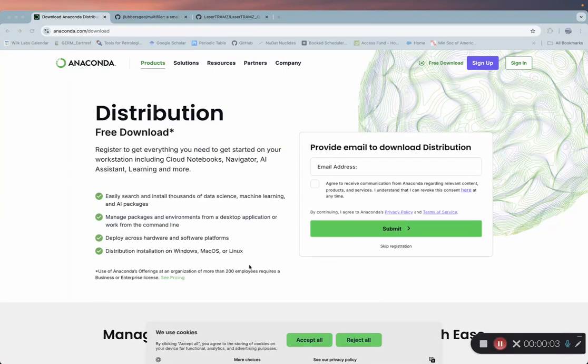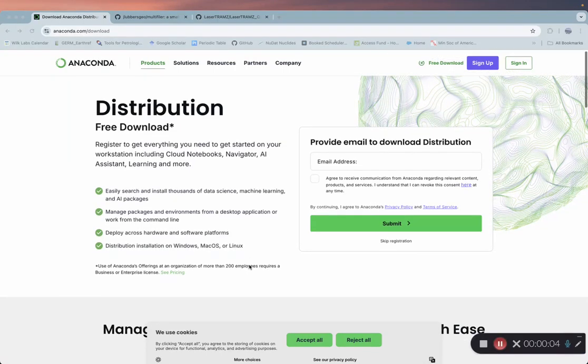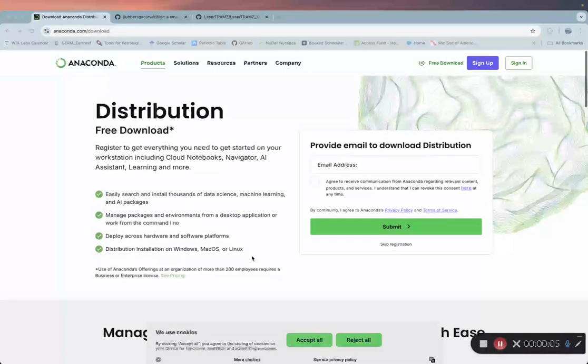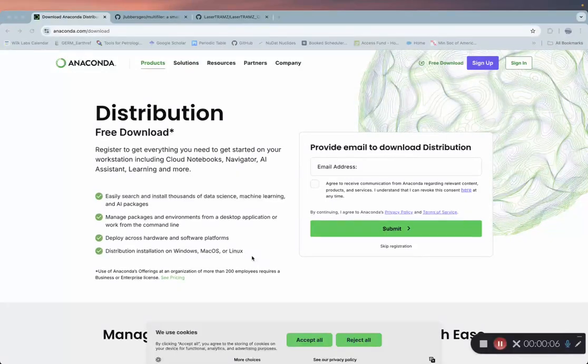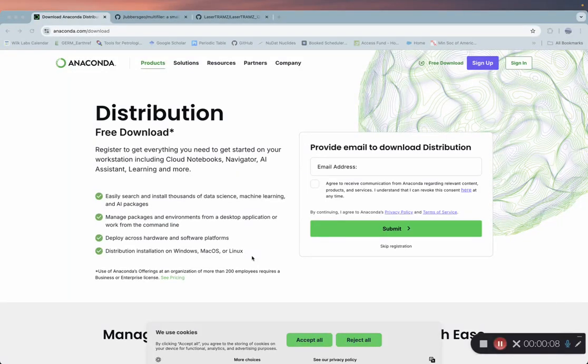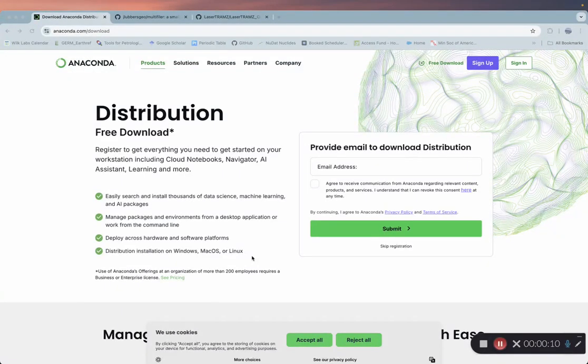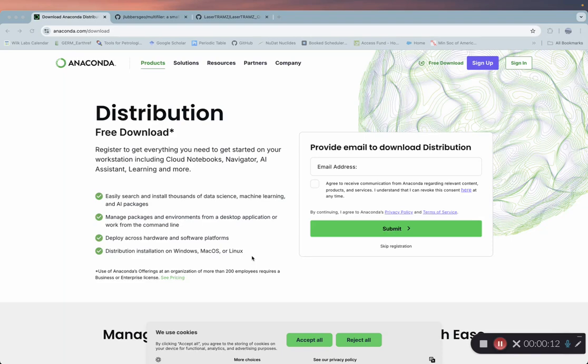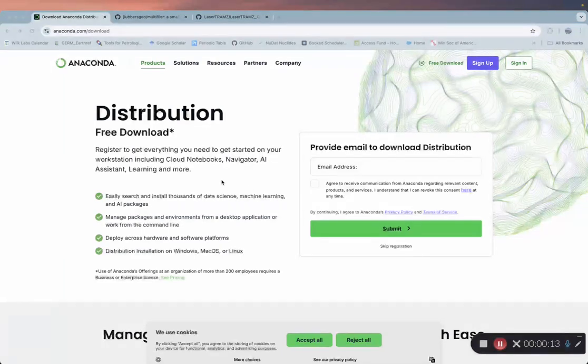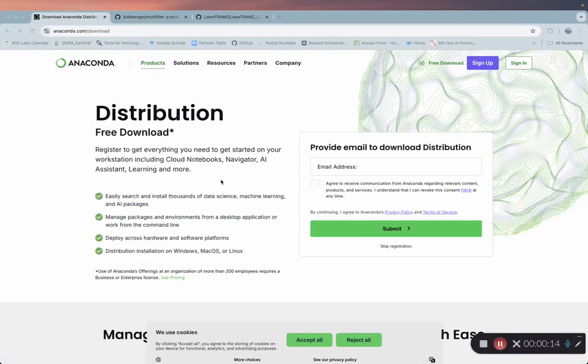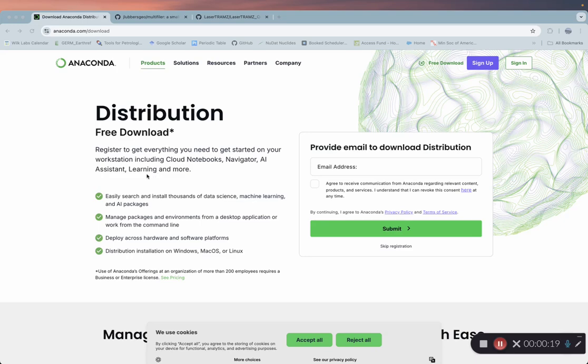We are going to go over installation for LaserTram Z, which is a program designed to reduce time-resolved uranium-lead data collected by laser ablation. The version we're going over is designed specifically to reduce data collected on a Thermo ICAP RQ.